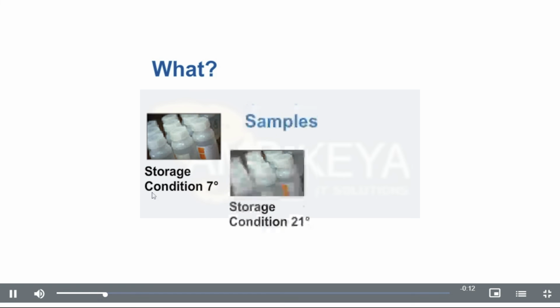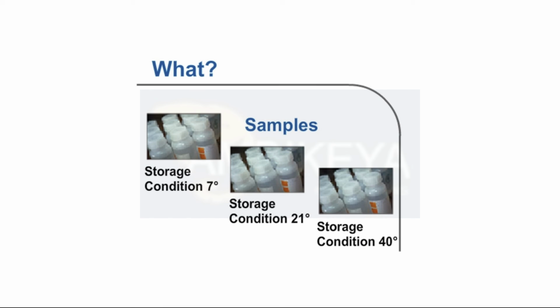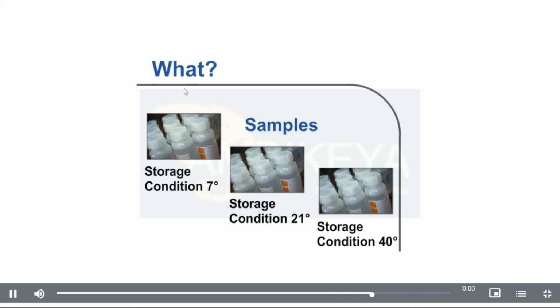In preparing your system for the stability study, you must first identify which different storage conditions will be tested in your company, and you must then define these storage conditions in customizing for stability study.